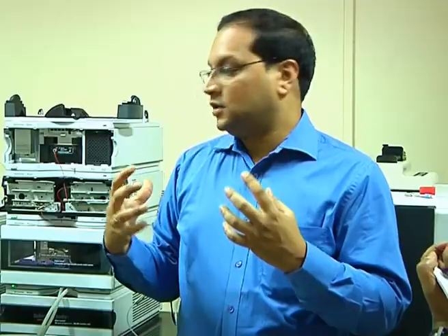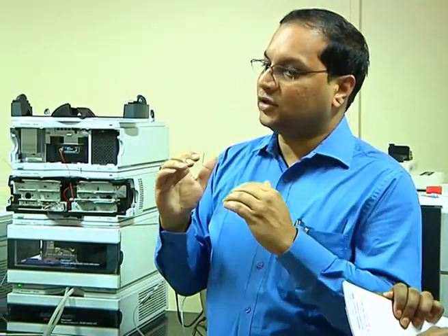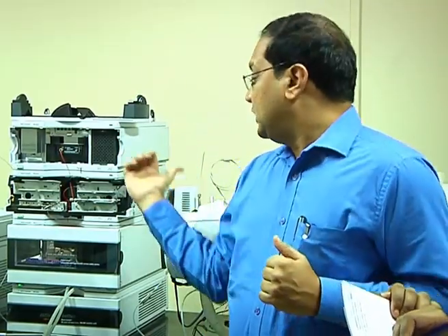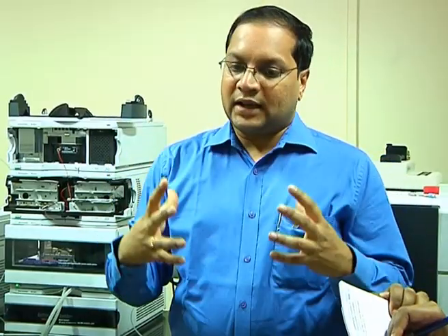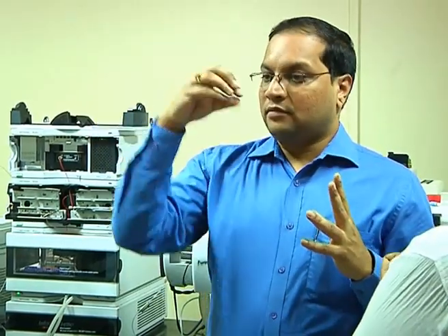I need charge, mass to charge. Unless my analyte is ionized, the MS is blind. It cannot see. So the prerequisite of an MS analysis is that your analyte must get charged. In electrospray, typically your analytes get ionized in solution, meaning in the solution itself it gets protonated, and ESI generally facilitates the ionization. It creates an environment where your ions move into the MS suitably.